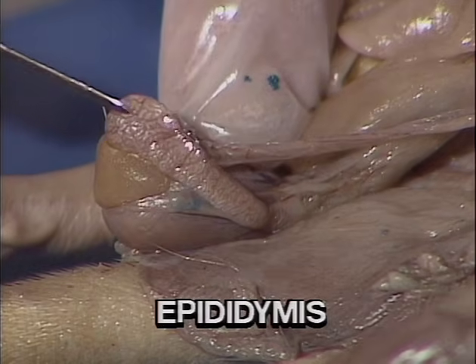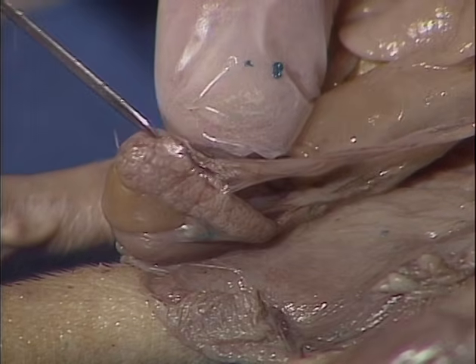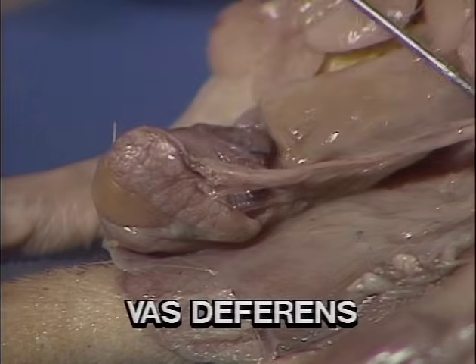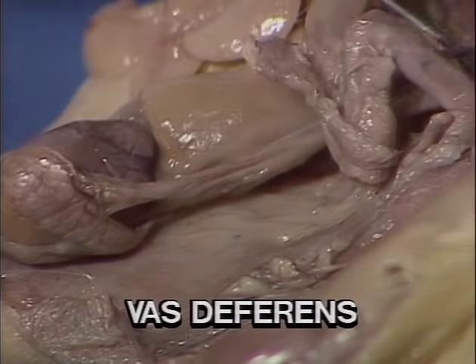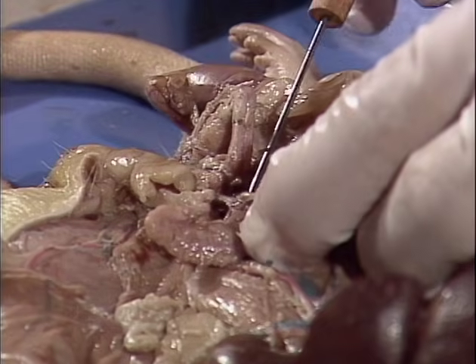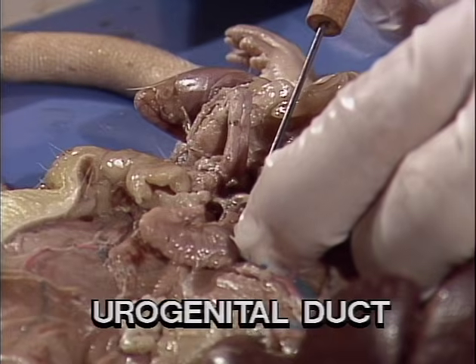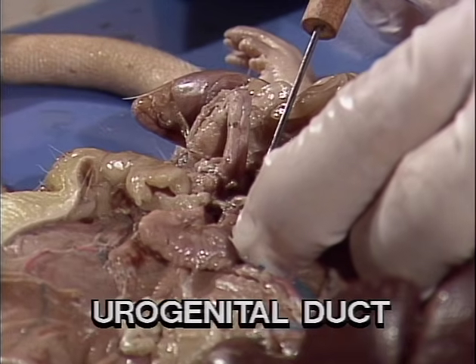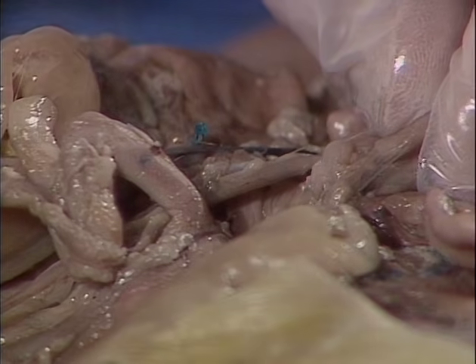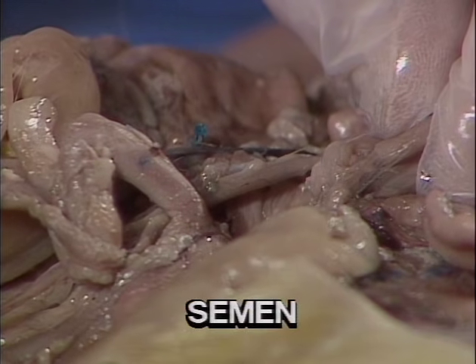When the sperm leave the body, they travel from the epididymis down this tube known as the vas deferens. And the vas deferens will go up and around, loop around the bladder, and continue as the urogenital duct. The sperm leave the male genital tract in a fluid suspension. This fluid is called semen.